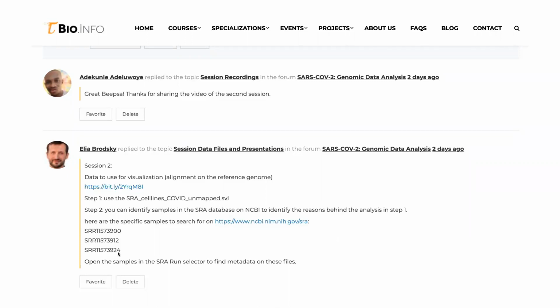So before we jump into this, did anyone have a chance to do this practice assignment? If you have tried it, then please type in yes, so I know how many people have been able to try. Okay, so Benjamin has, and Kita. Okay, so we have a few. Okay, Manish has not tried. Okay, I know that Adekunle tried.